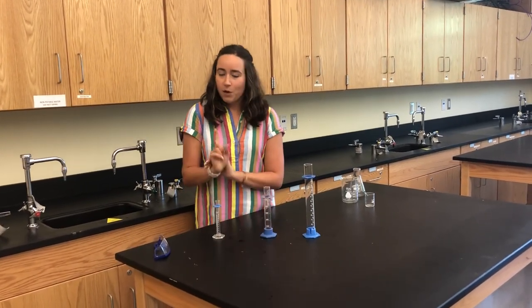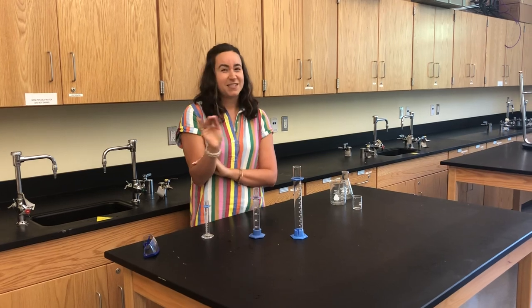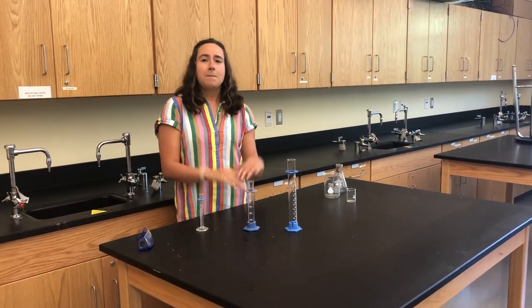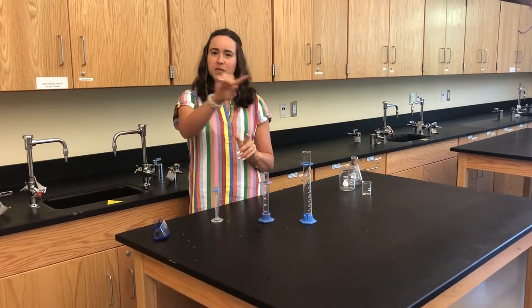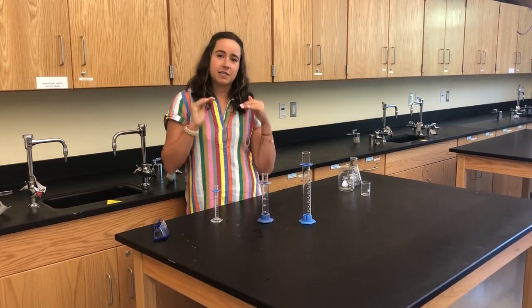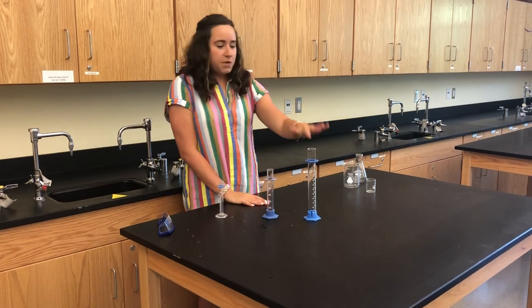One important thing when measuring in a graduated cylinder: you want to measure to the bottom of the meniscus. Liquid has the tendency to stick to the sides of the container, forming a little curve, and you want to make sure you're measuring to the bottom of that meniscus to get an accurate measurement.